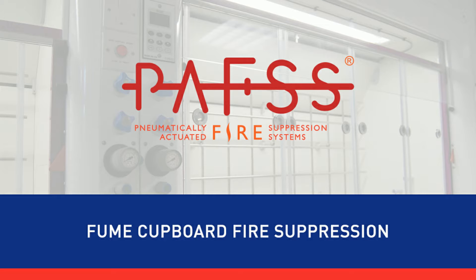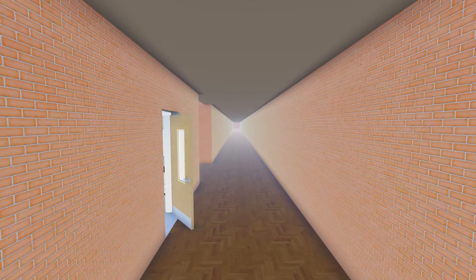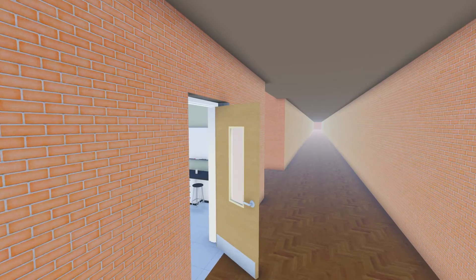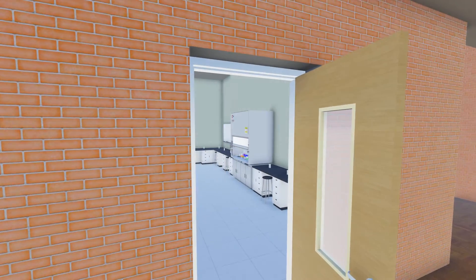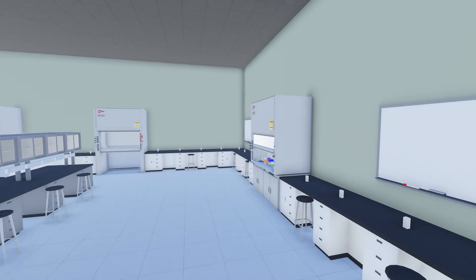PAFS Fume Cupboard Fire Suppression Systems. Laboratory fume cupboards can present a particular problem where multiple users and a wide range of chemicals and processes increase the risk of fire.